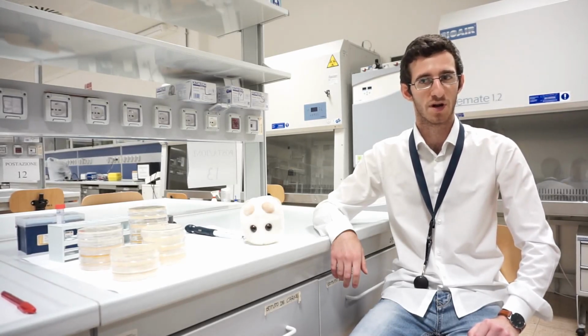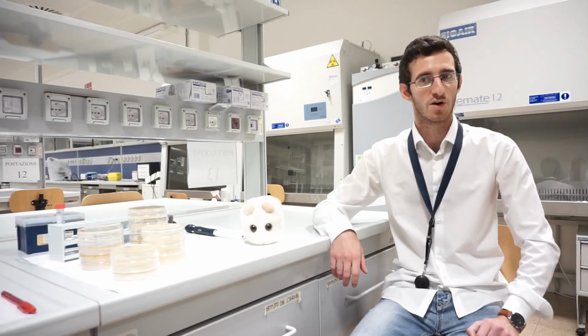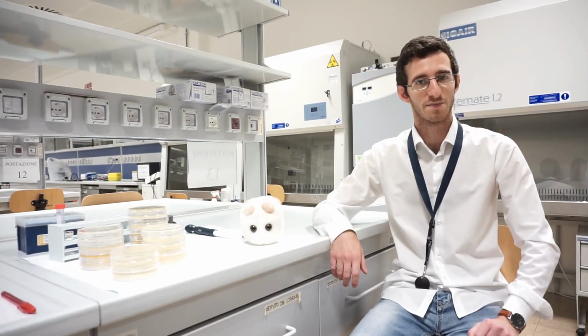In this work, we would like to show you the protocol to study P53 sequence-specific transactivation functions using yeast as a model system, exploiting a color reporter gene, or the luciferase, or on the quantification of cell growth, to highlight the main experimental steps and the versatility of these approaches.